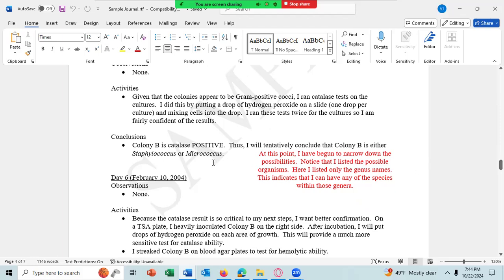The species is either a member of Staphylococcus, either Staphylococcus epidermidis, Staphylococcus aureus, I don't know if there's another Staphylococcus, or a Micrococcus species. And there's at least 3 Micrococcus species. Micrococcus luteus, Micrococcus varians, and what's the other one? Don't remember. Now there's a 3rd Micrococcus species.